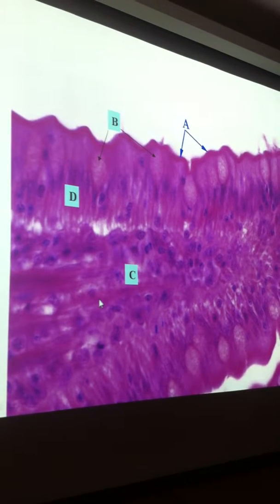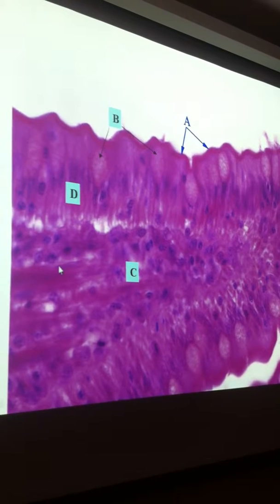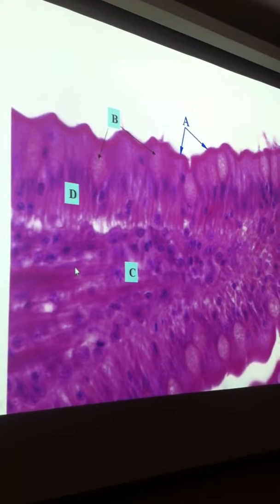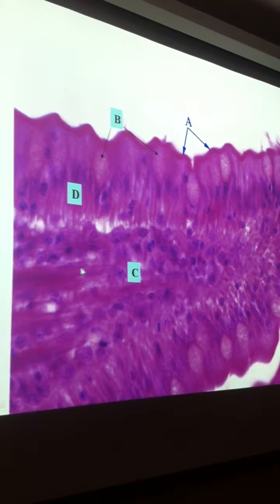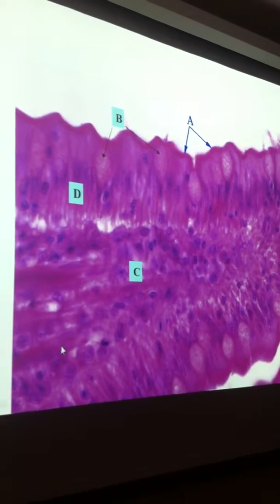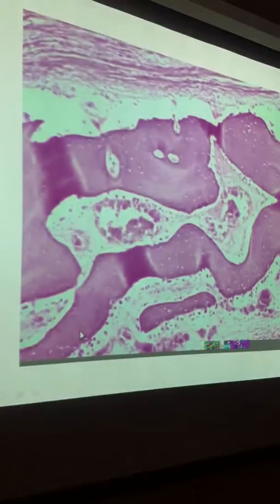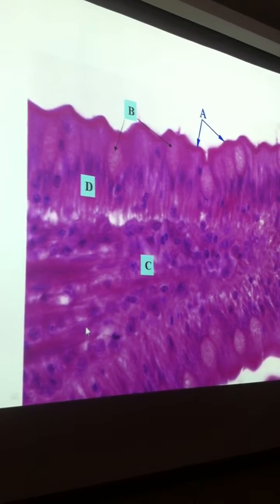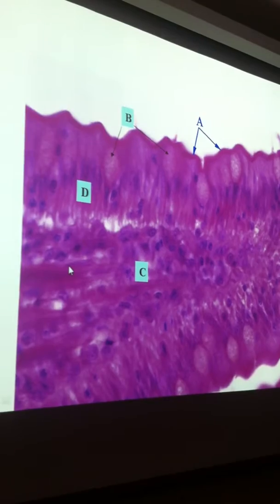These structures: collagen bundles, beautiful. So if these are collagen bundles, that makes these cells what? Fibroblasts. Look at the euchromatin. Very little heterochromatin and lots of euchromatin. Besides, they have the orthodox appearance, like enlarged.